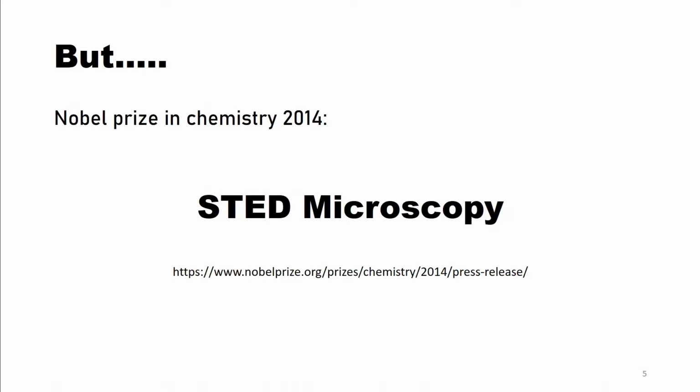But as always, there are exceptions, and maybe you heard about STED microscopy. It even was rewarded with the Nobel Prize in Chemistry 2014. And it is a special form of an optical microscope that is not limited to Abbe's resolution limit caused by diffraction.